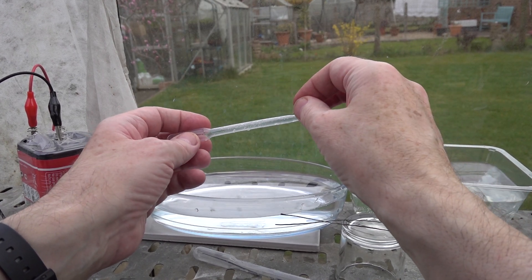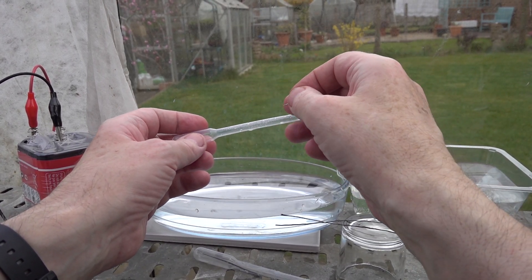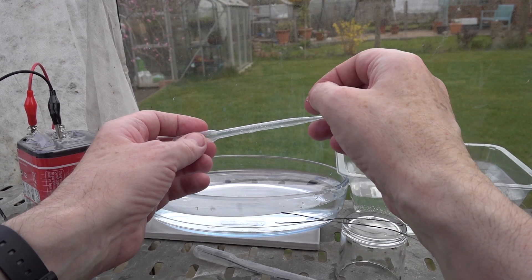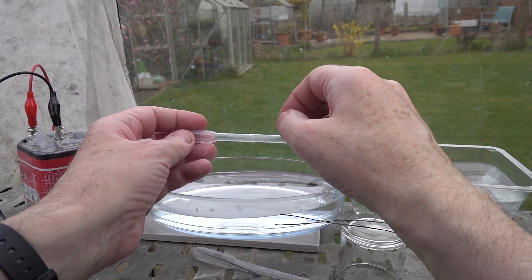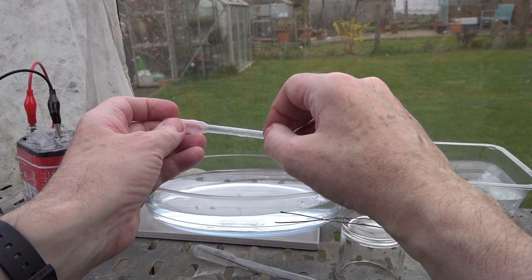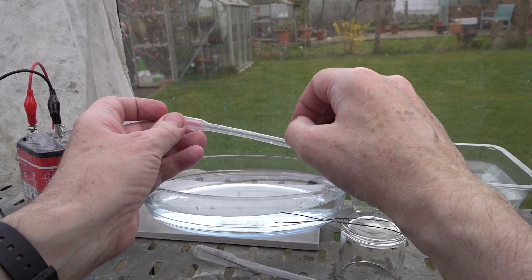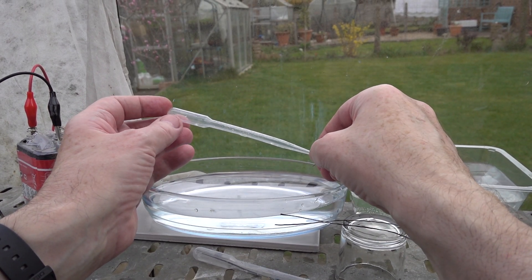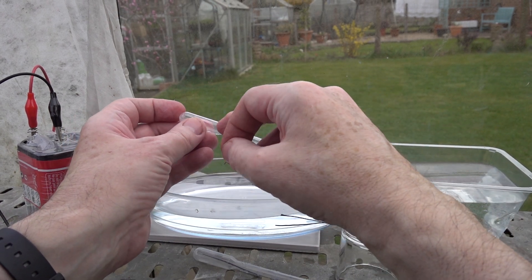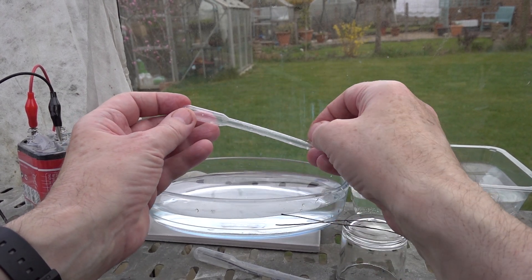What happens then is the electrolyte passes through the holes, but the gas that forms around the carbon fiber doesn't escape. The little bubbles tend to remain in the pipette, coalesce together, and then if you've got a slight slope on the pipette whilst in operation, they'll flow up and collect in the end of the pipette, in the bulb.